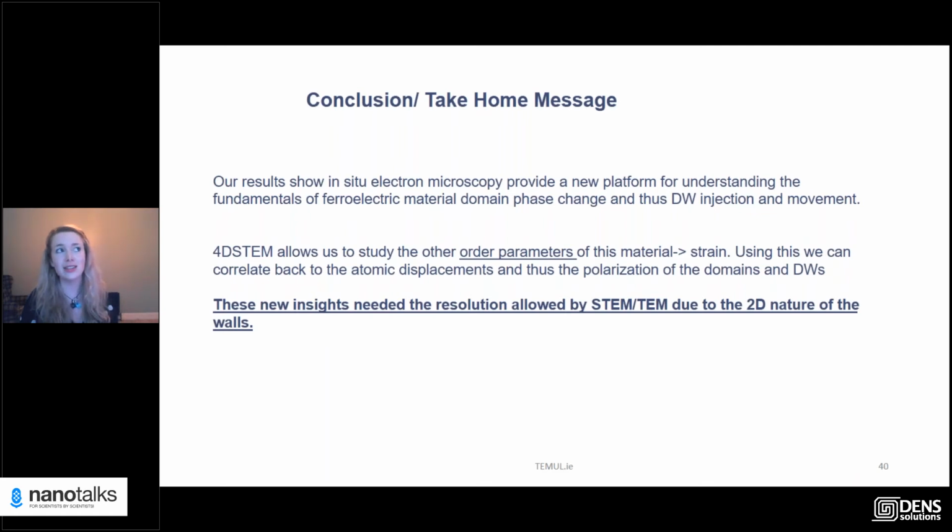And for ferroelectrics, if all that's governing whether you get something conducting or not is a slight pico displacement, then you really need to be able to use aberration corrected STEM. And for us, we also combine that with 4D STEM, which I know a lot of groups now are using heavily. Before it was a lot of ferromagnetic groups, and now more people are starting to use it for ferroelectrics as well.